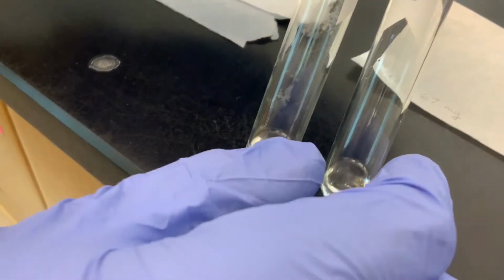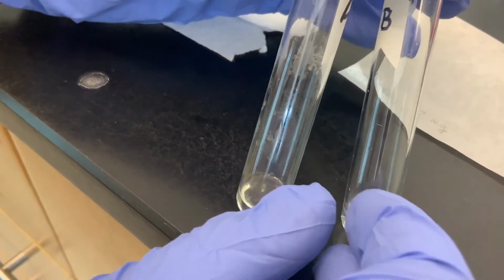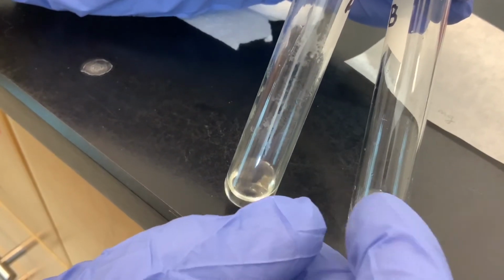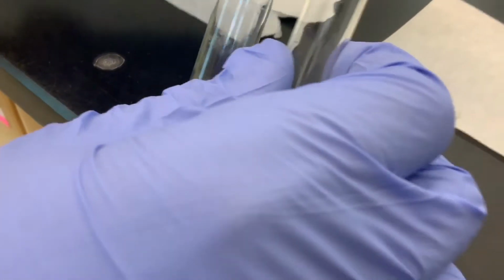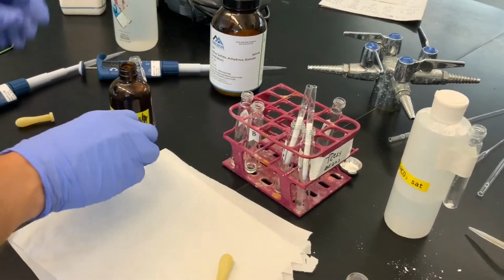Whereas here in part B, once again, you don't see that. All you see is little droplets of water stuck to this glass. So this is more wet than that one. So I did a better job transferring part A than I did part B. But regardless, we're going to dry both layers with the anhydrous sodium sulfate.